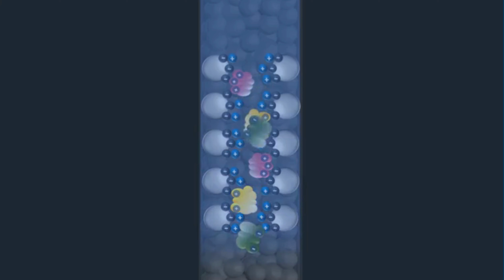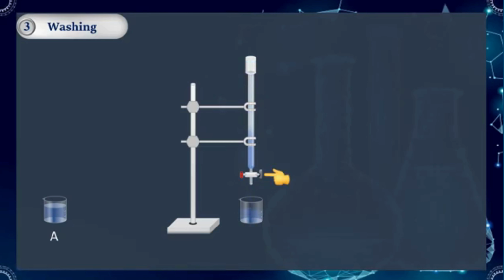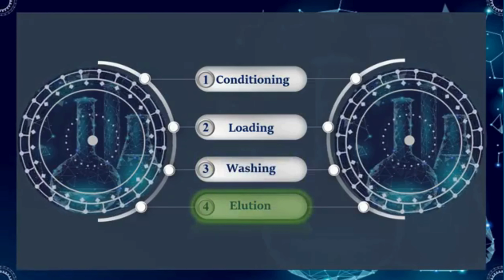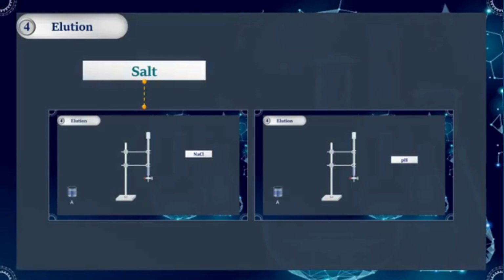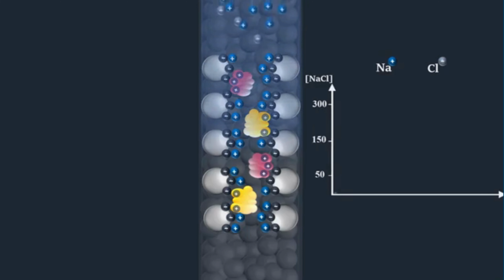Resin fouling and its control. Fouling is the loss of effective exchange capacity or mass transfer performance caused by contaminants that block pores, occupy exchange sites, or interact irreversibly with the polymer. Important foulants include suspended solids and colloids, iron and manganese oxides, silica, oils and greases, natural organic matter, proteins and other macromolecules, bacteria, and algae.